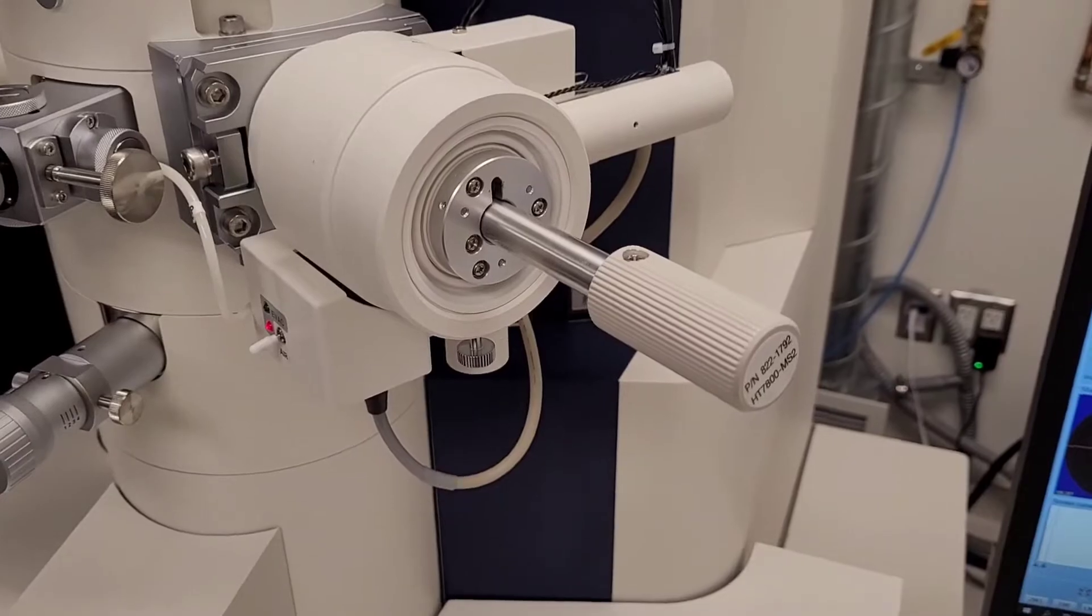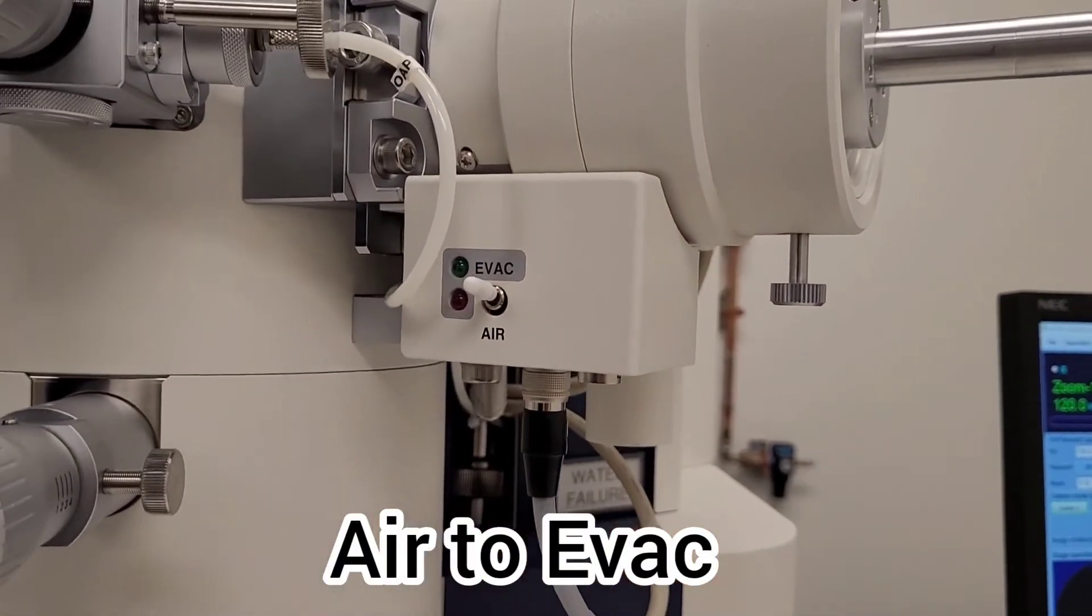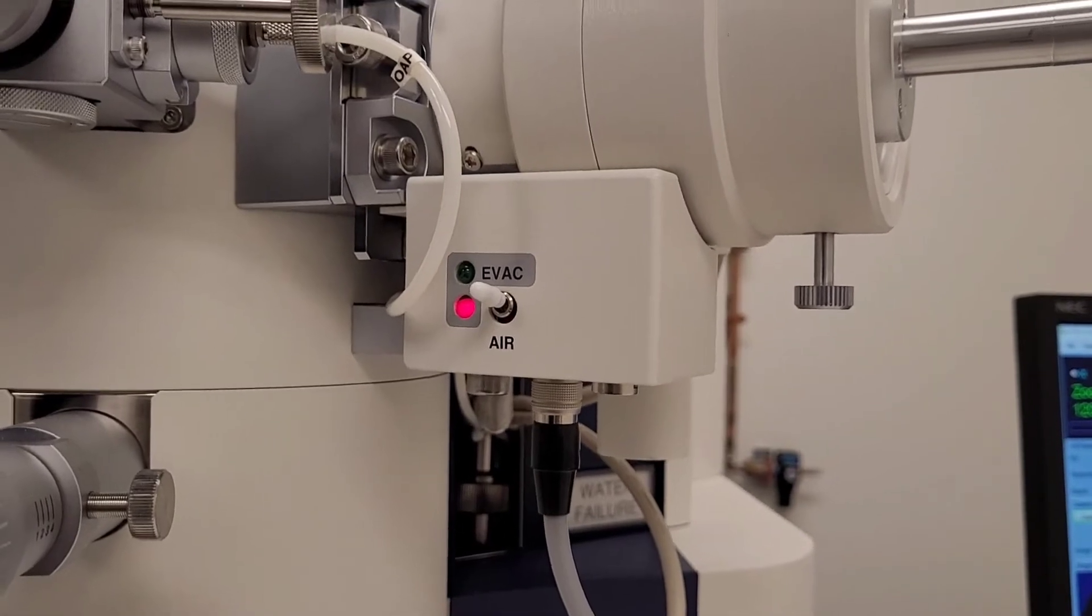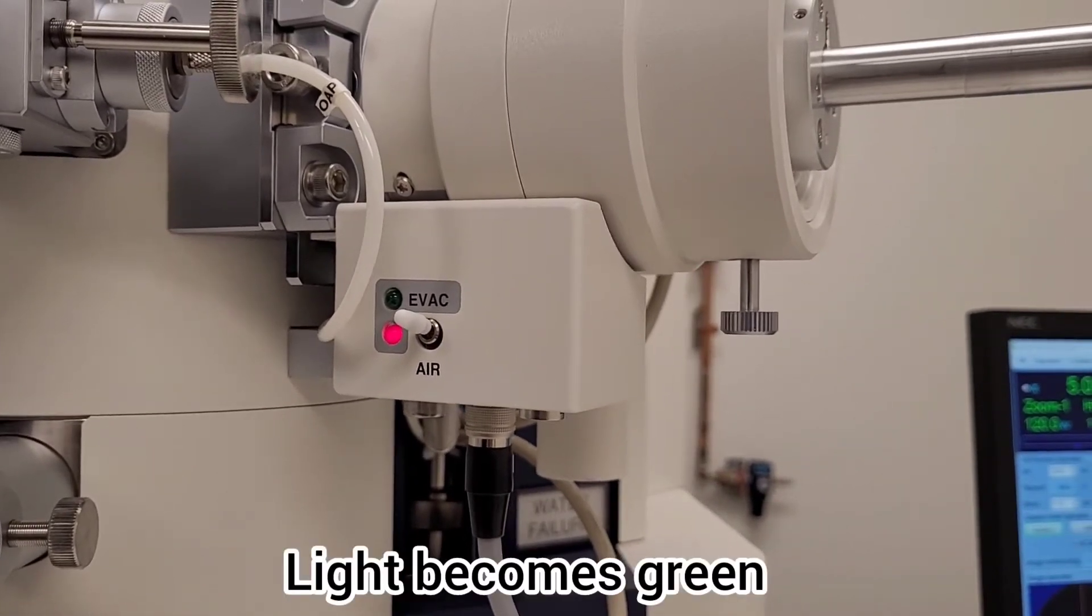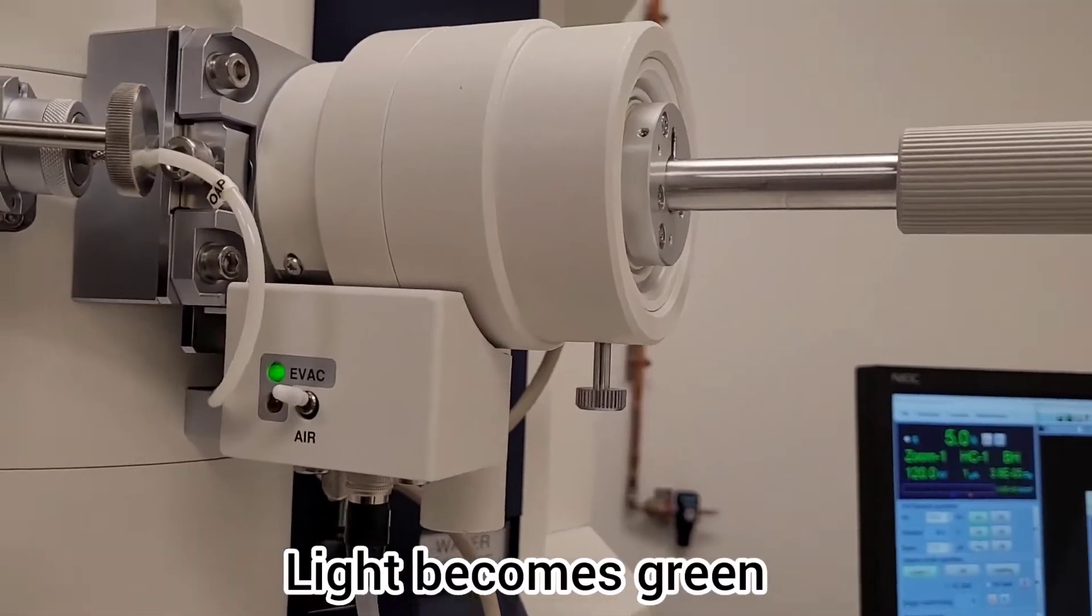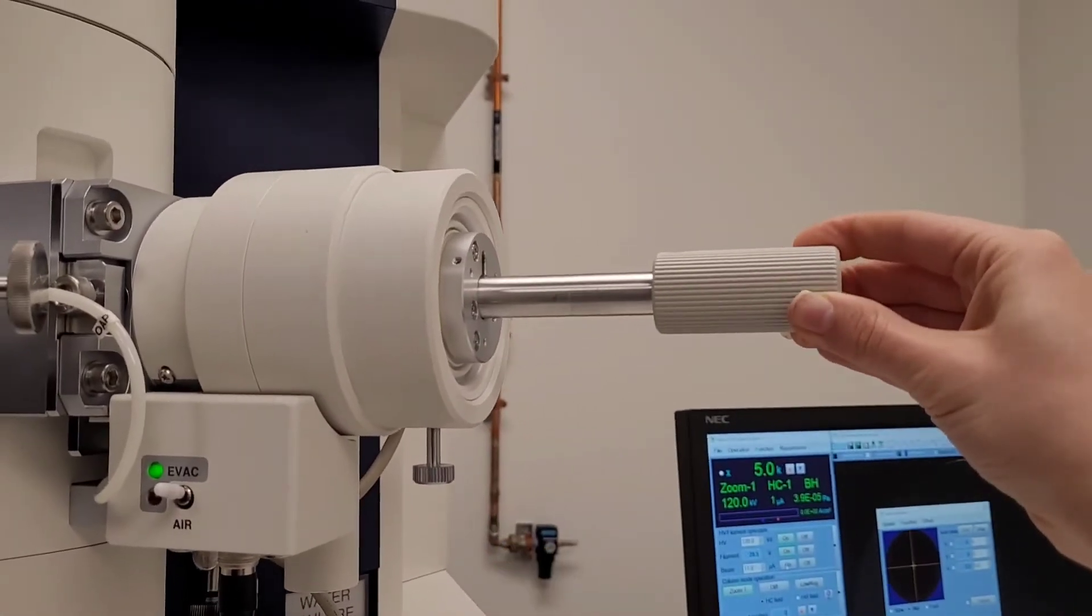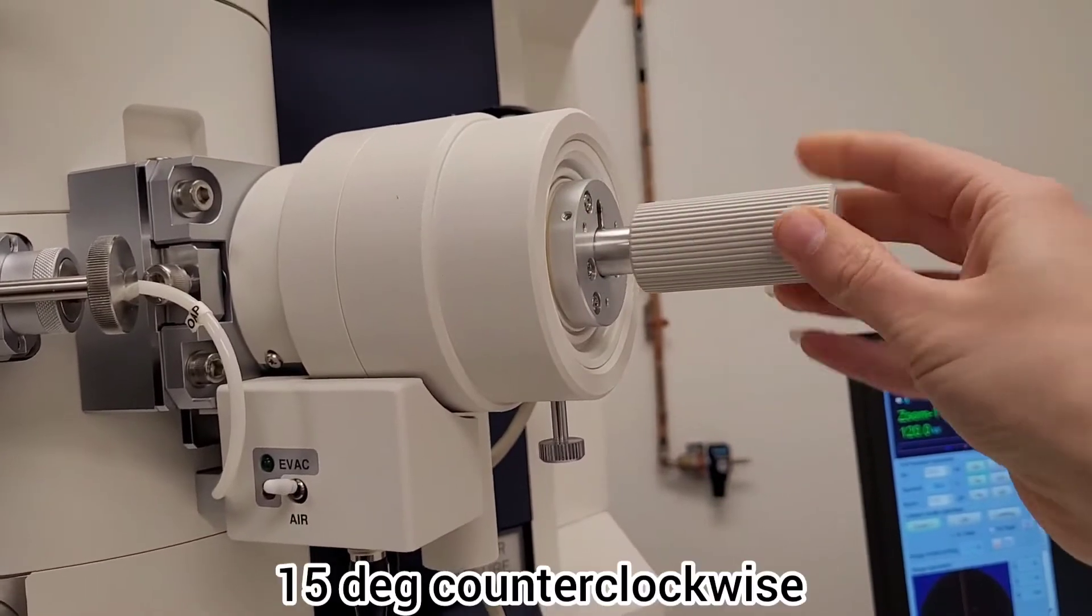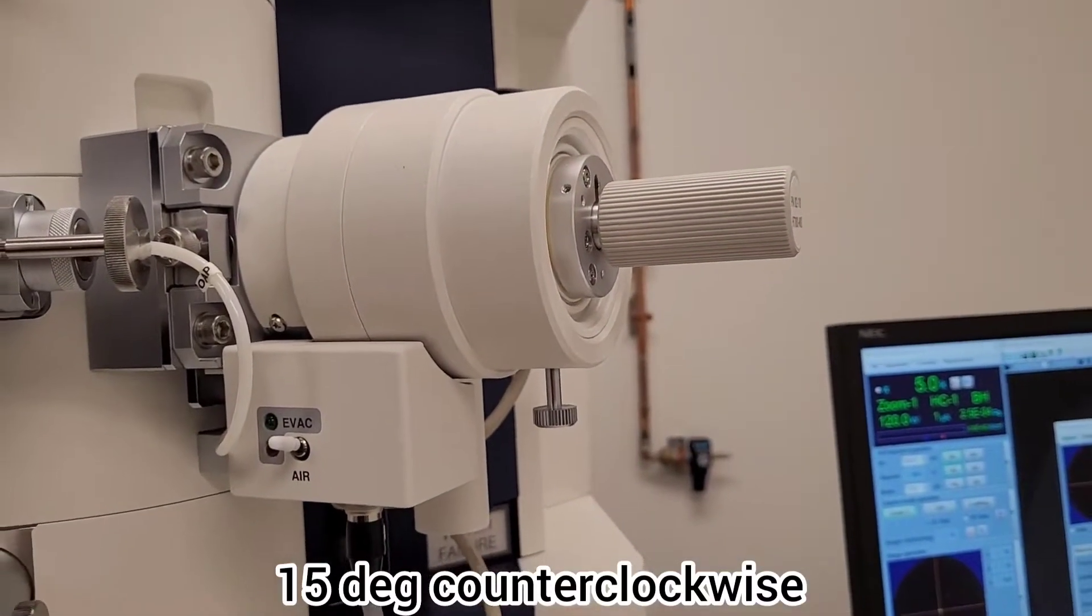Align the notch and then you want to set the air to EVAC. The light will become green. Once that happens, you can turn it 30 degrees clockwise and it will just insert. Then 15 degrees counterclockwise.